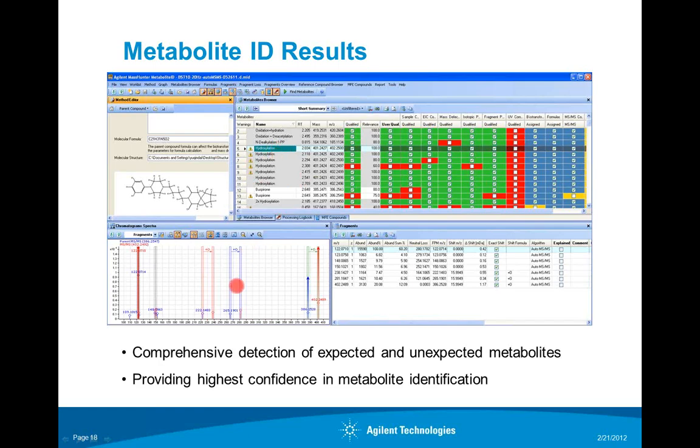By clicking each individual metabolite, this window will display the chromatograms or the spectra, by clicking this pull-down menu to select the option. What you see here is an overlaid MS spectra of the parent molecule and one of the metabolites. The Novacia auto-shift algorithm will indicate which fragment ions have been shifted.